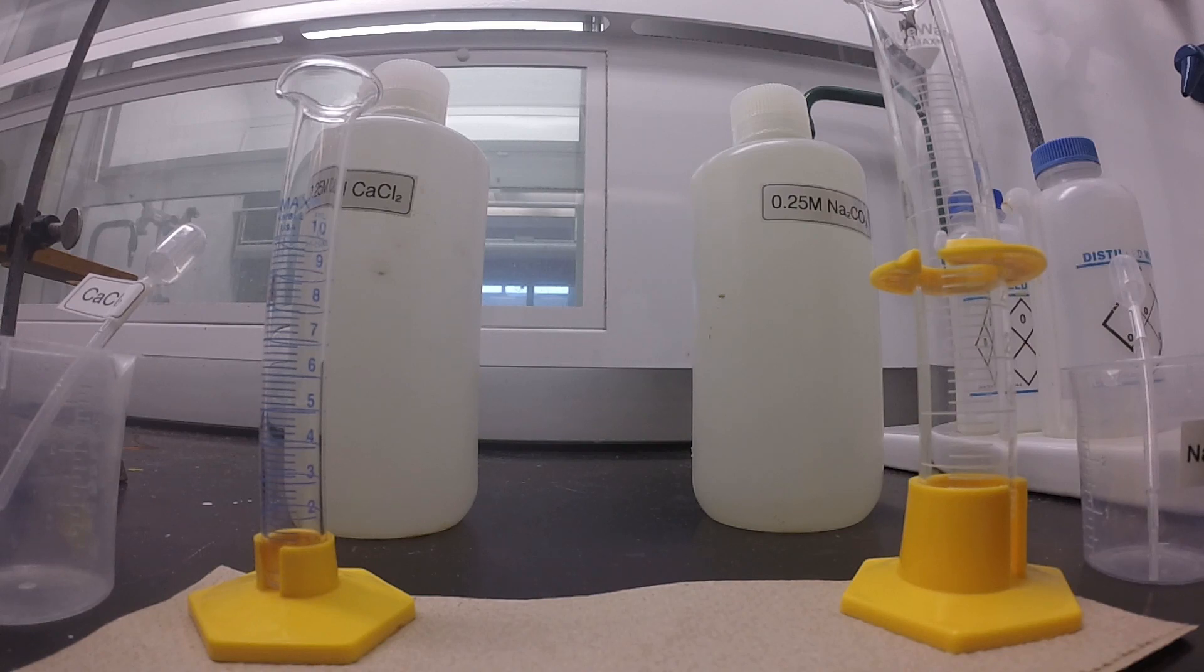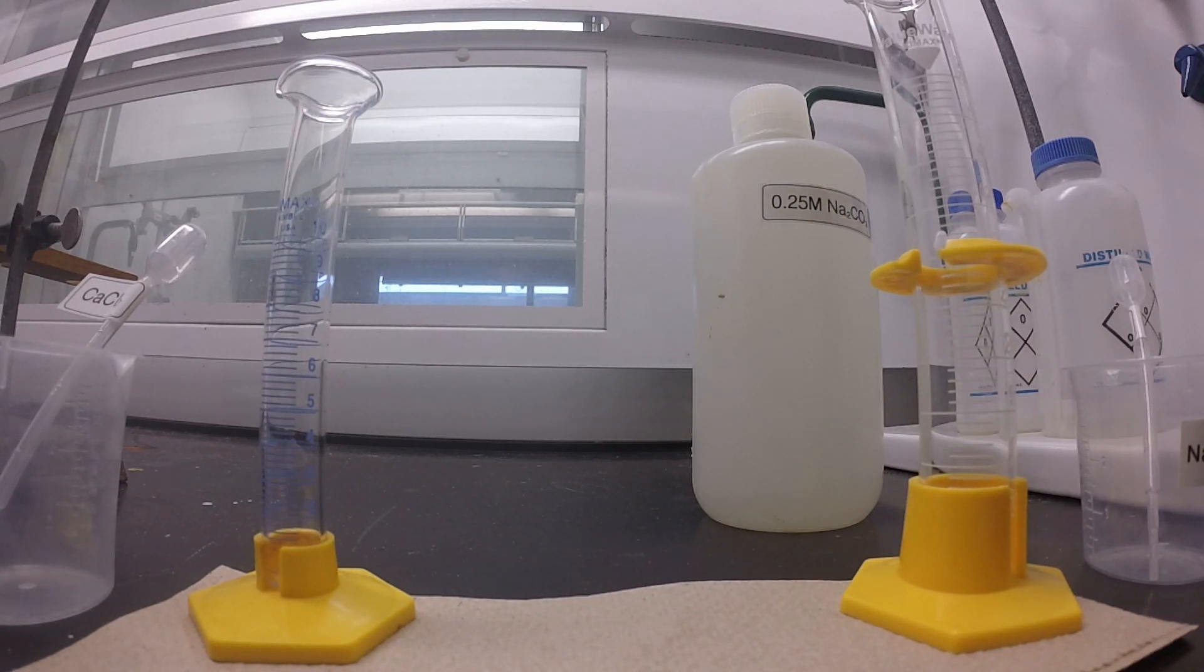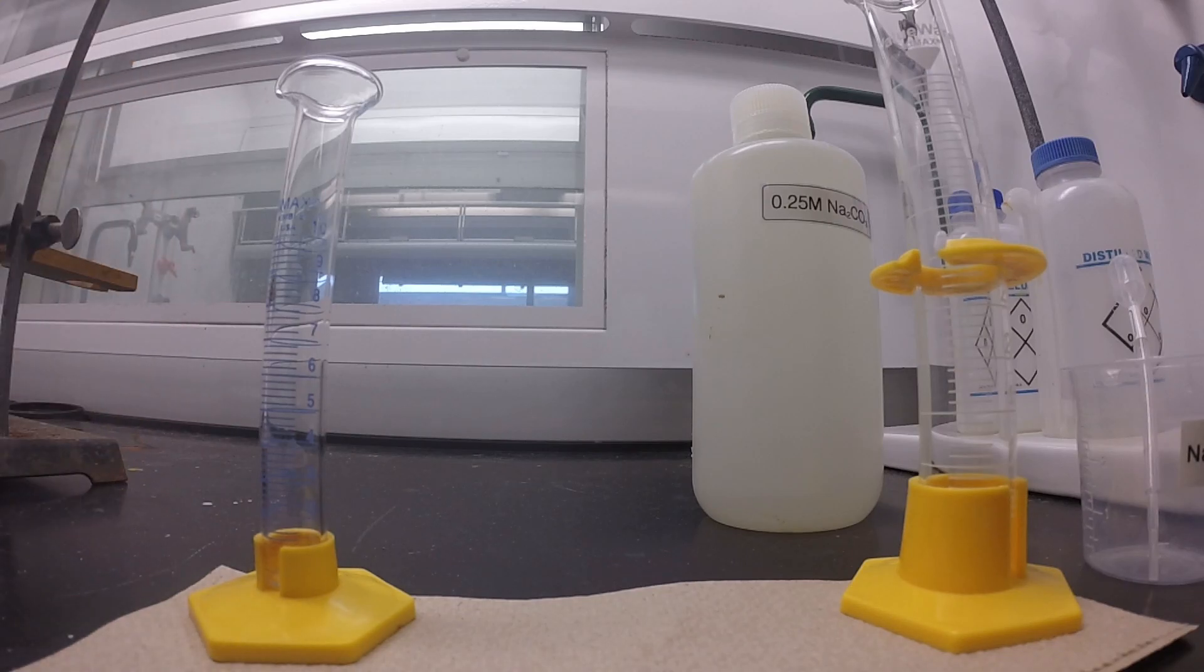We have two solutions we're going to use in this experiment: 0.25 molar calcium chloride and 0.25 molar sodium carbonate. We're going to start by pouring out each of the solutions into a small beaker. This is going to make it easier to measure in the graduated cylinder.